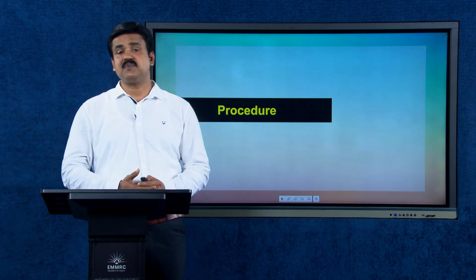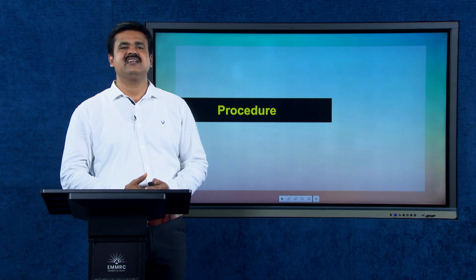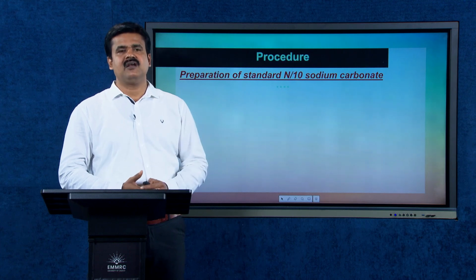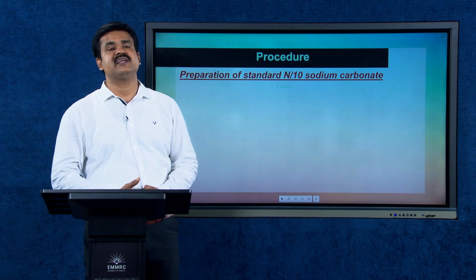Now, experimental procedure. We have to discuss the experimental procedure first, and then we can demonstrate the present experiment. This is about the experimental procedure. First of all, we have to prepare a standard N/10 sodium carbonate solution.